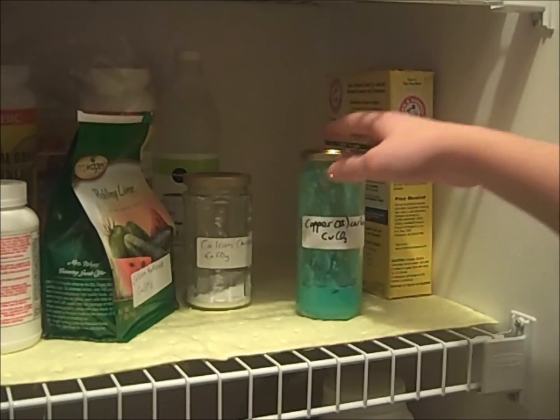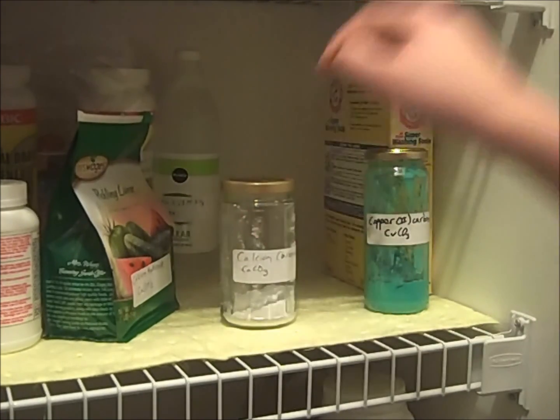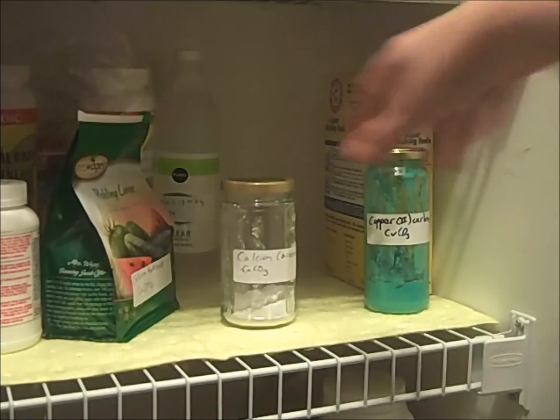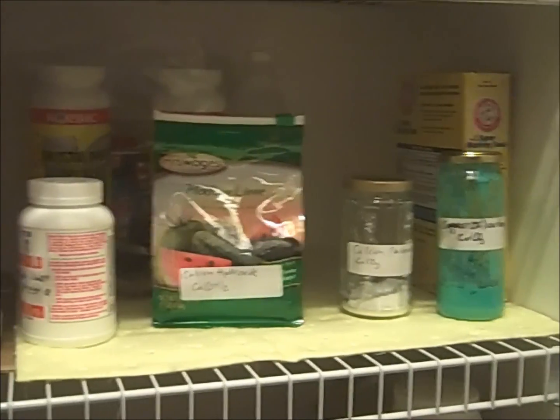This is copper(II) carbonate, which is produced by mixing copper sulfate and baking soda in stoichiometric amounts. This is calcium carbonate, which is produced by mixing calcium hydroxide and sodium bicarbonate in stoichiometric amounts. This is calcium hydroxide, which is sold at grocery and hardware stores as pickling lime, which is a food product.